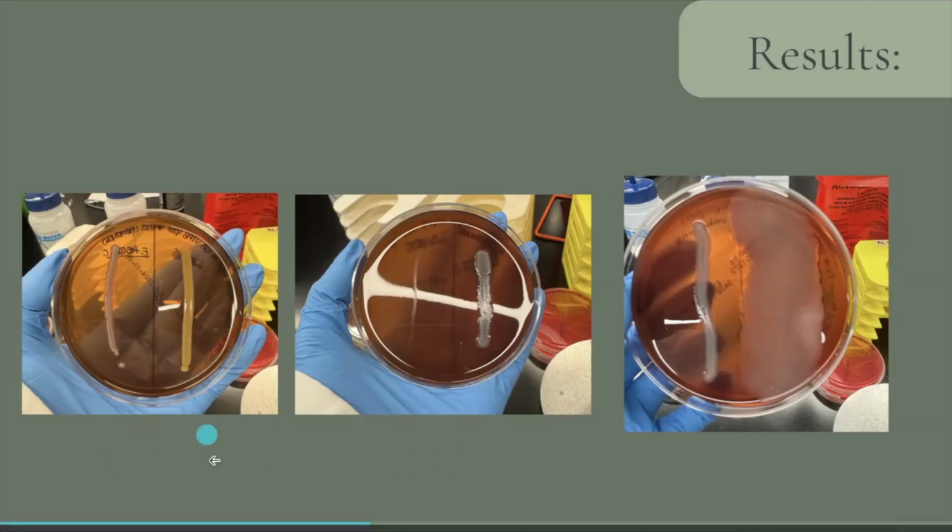For SRS, this one right here, there's a faint shadow-like ring around it. There are likely two zones, so it could be beta because of these two zones. And E. faecalis, there was no hemolysis present, so we interpret it as gamma. For our unknown 114, we saw a clear ring, so it's beta, complete lysis of red blood cells. And unknown 294, we saw gamma, no hemolysis.